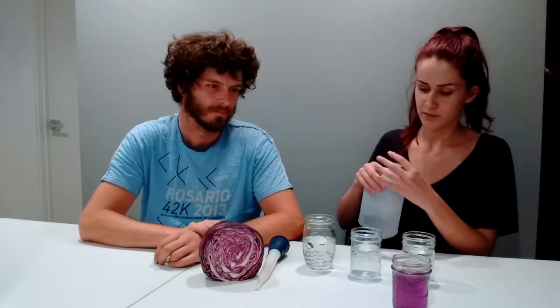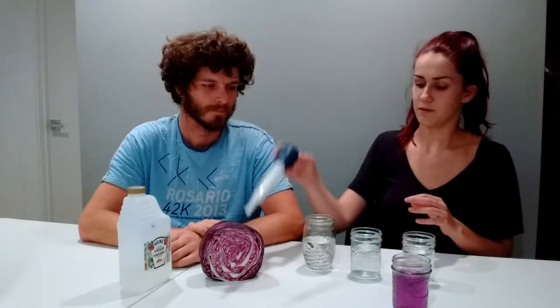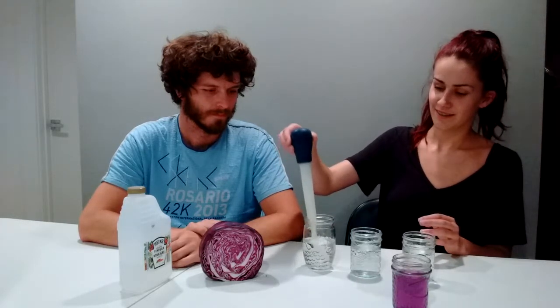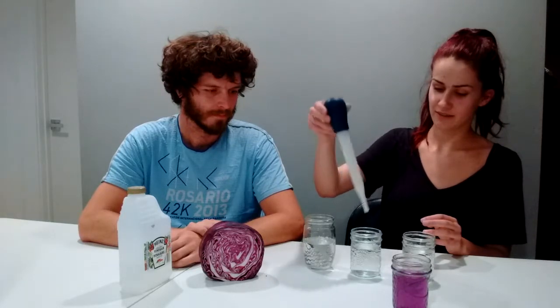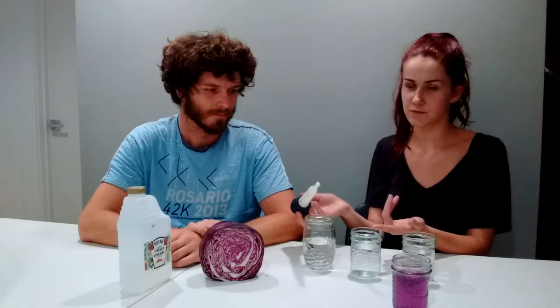Okay. Alright, so let's say this one's patient 0, and let's say that these 2 are doing an exchange together. So patient 0 is exchanging with this one, and ideally they would have separate pipettes, but I guess it doesn't really matter since this one we know isn't infected. So let's just say they both swapped. But either way, this one is now hopefully infected. I'm not sure if it will show up on the test. So we have patient 0 infected and a cup that didn't get an infection.